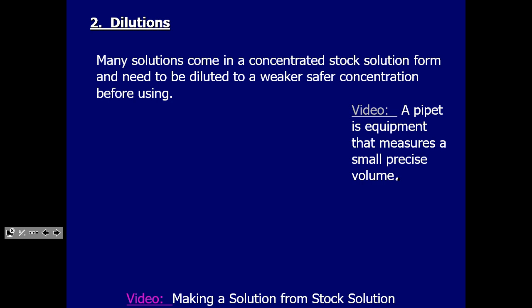It's okay. I use this device here. It's called a pipette pump. Years ago, they would use their mouth. Danger, danger, danger, in case you have a hiccup or something as you're working this machine. The pipette pump is essentially like a syringe, you know, like a syringe pump. It's got a little end on it that you can stick the little straw in. And so you draw it in, the liquid's coming up, you can see it.